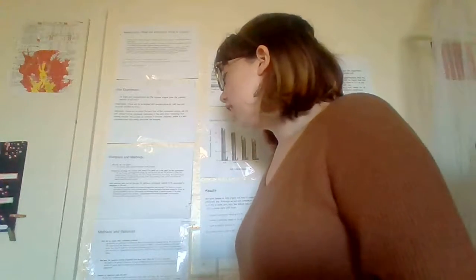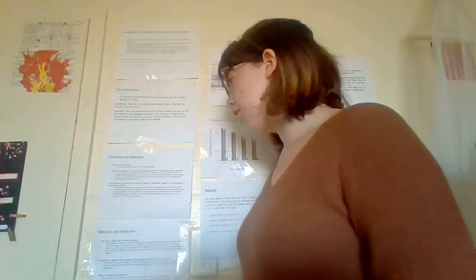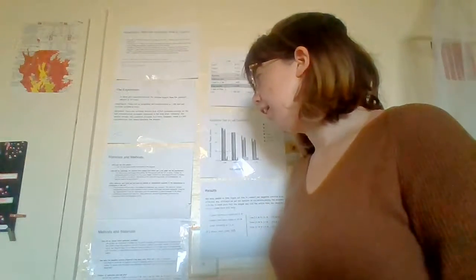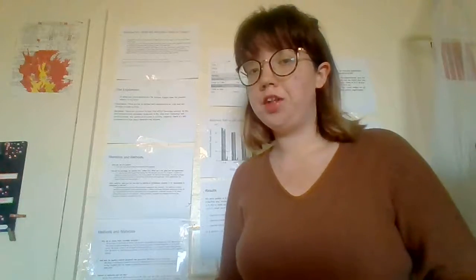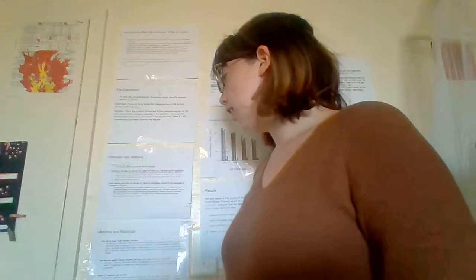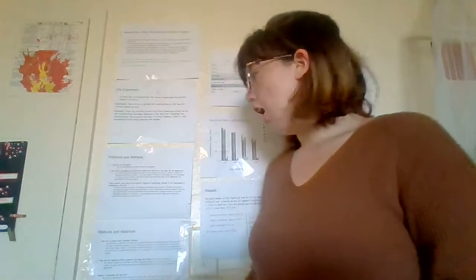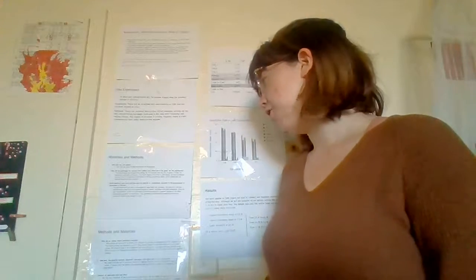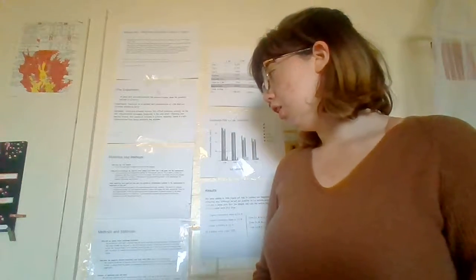spectrophotometer. What substrate did we use, and how did the addition of the sulfanilamide correlate to the measurement of the absorbance at 440 nanometers? The substrate that we used was azocasein, which is a milk protein. The substrate contains sulfanilamide groups that, when digested, produce a red-orange color.